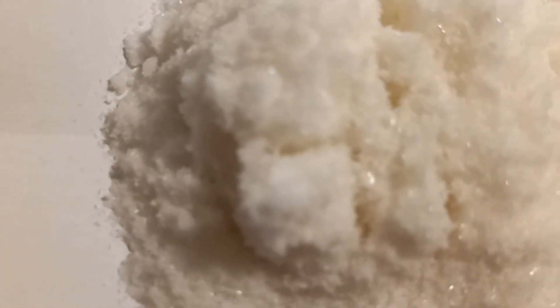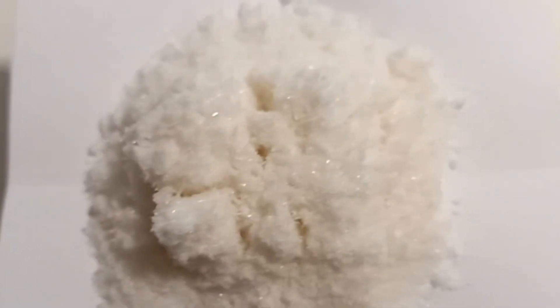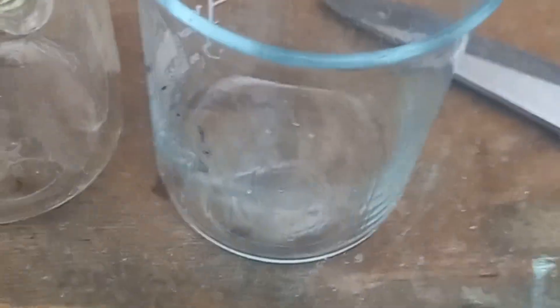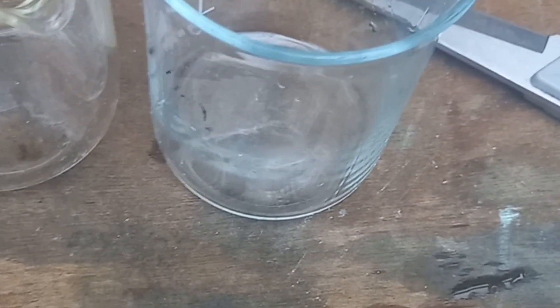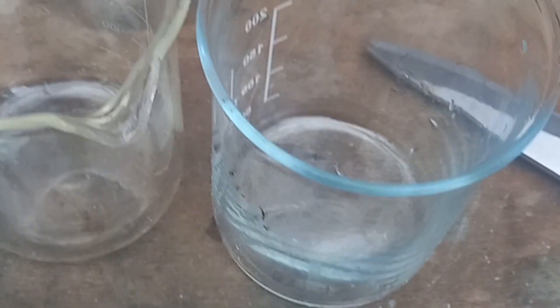We got some nice sparkly glycine hydrochloride — about 6.6 grams, a little bit more than expected. I have 3.12 grams of glycine hydrochloride and 2.38 grams of copper chloride dihydrate, which I'm dissolving in ethanol and then combining together. I'm either hoping for a precipitate or will slowly evaporate it to get the glycine tetrachlorocuprate. It's a brilliant green solution as expected of tetrachlorocuprates, but with a little yellow hue which is interesting.